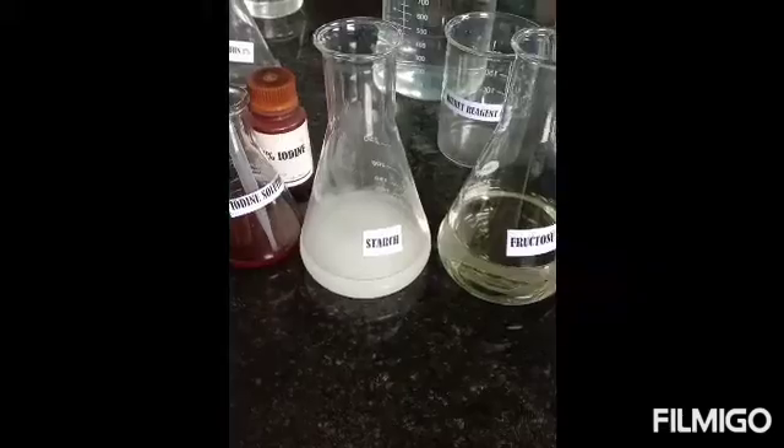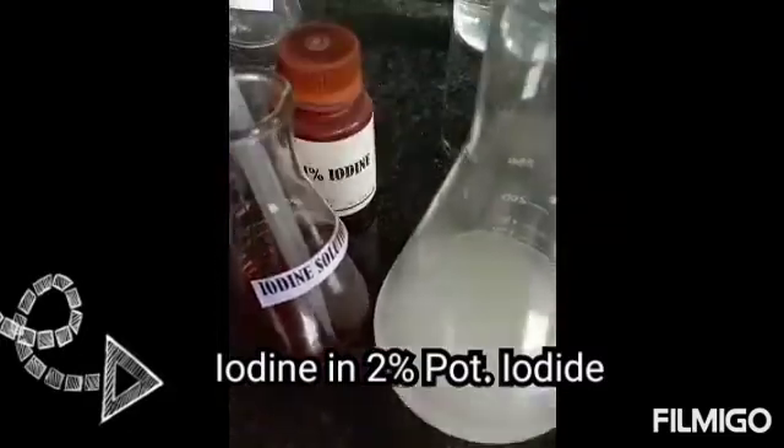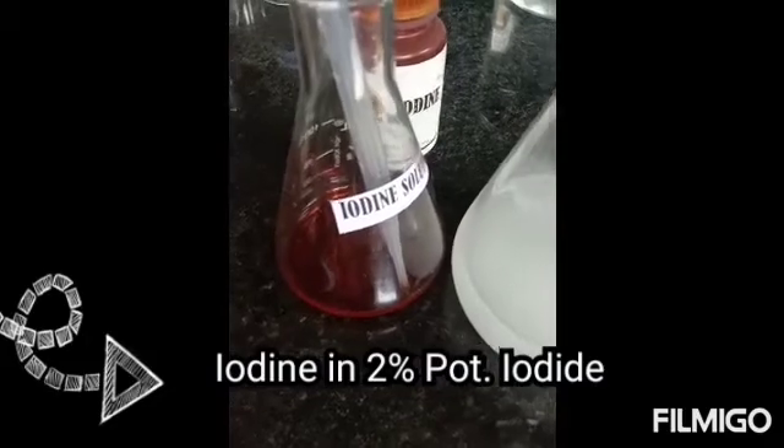Iodine test for starch. The iodine solution is prepared by adding a few crystals of iodine to a 2% potassium iodide solution.